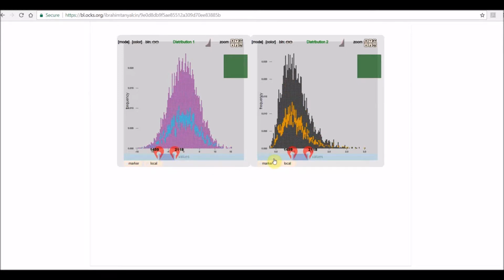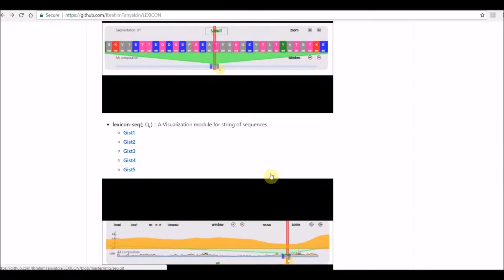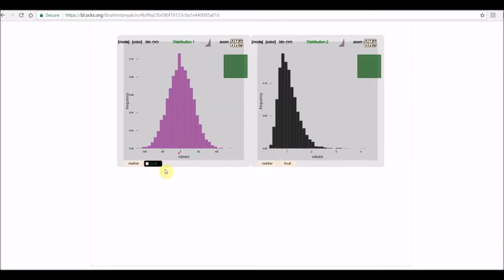Now, there is not much interesting going on in this sort of setup, but what you can do is sort these variations, and then you're going to have a more interesting trend. For example, in this case, I sorted the data points in this left histogram in an ascending manner. Okay, it might not always make sense scientifically.